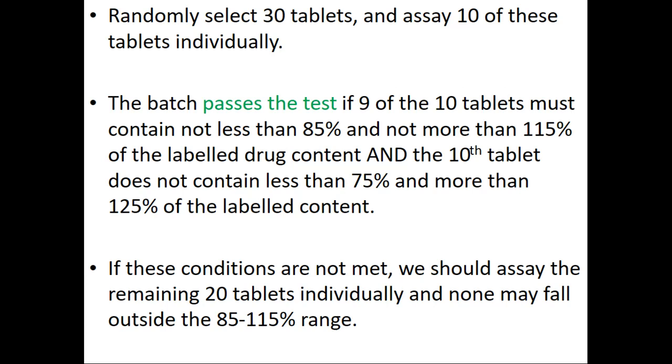If these conditions are not met, we should assay the remaining 20 tablets individually.